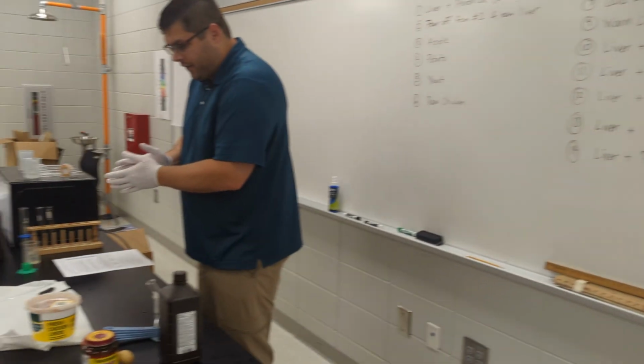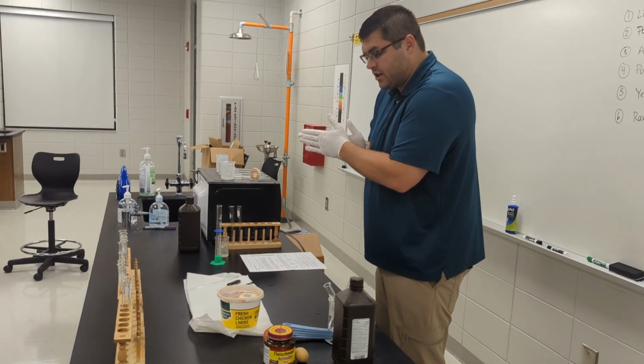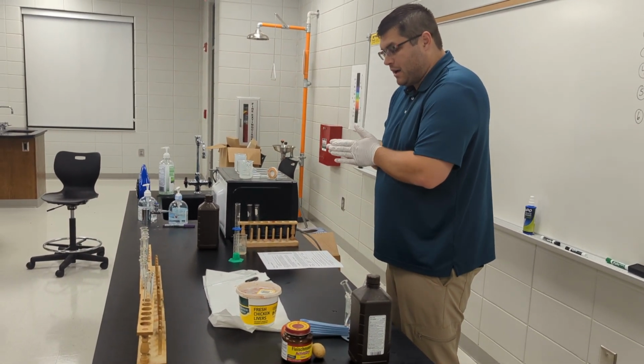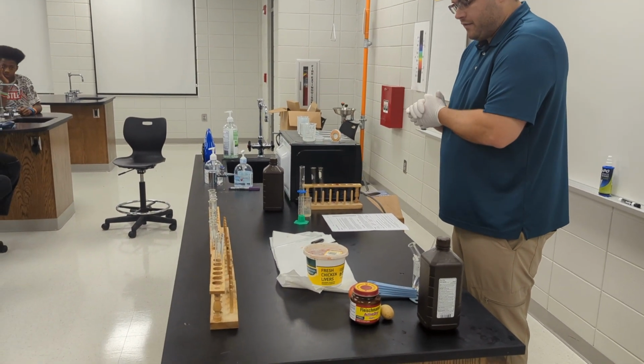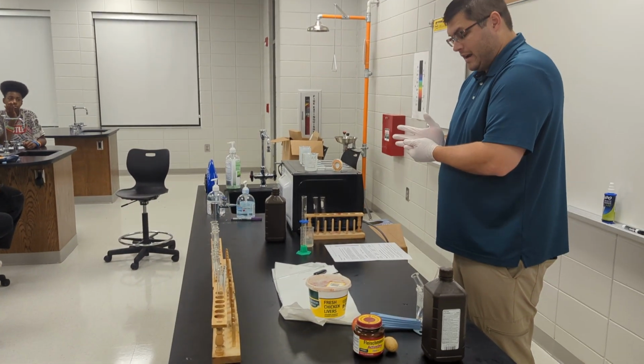All right, so starting off, let's just read the objectives. This is measure the effects of changes in temperature, pH, and enzyme concentration on reaction rates of the enzyme. Explain how environmental factors affect the rate of enzyme catalyzed reactions.